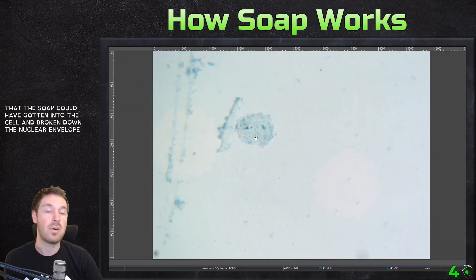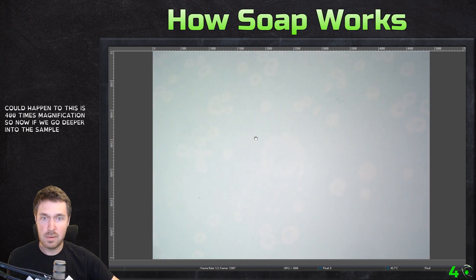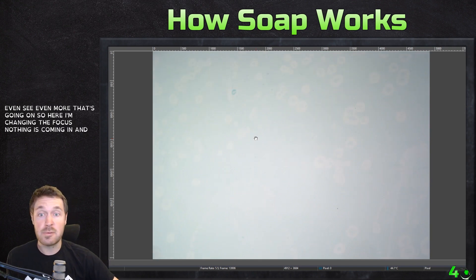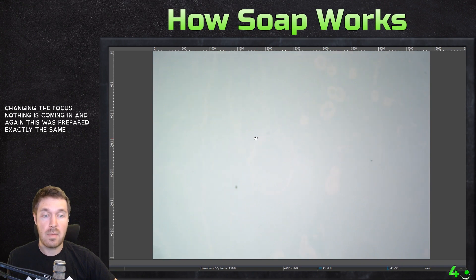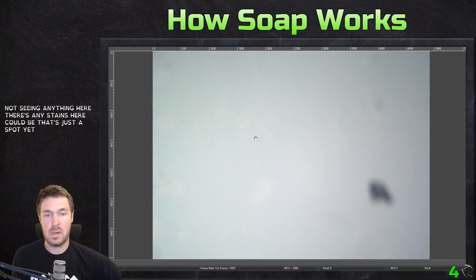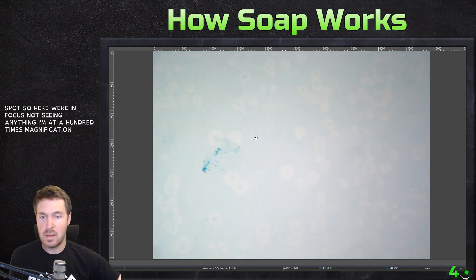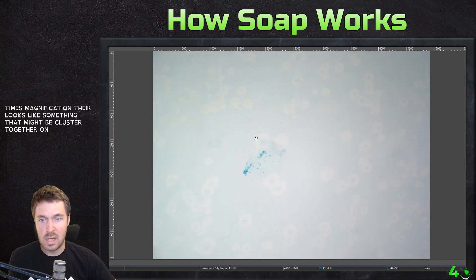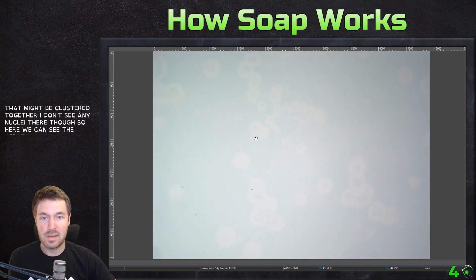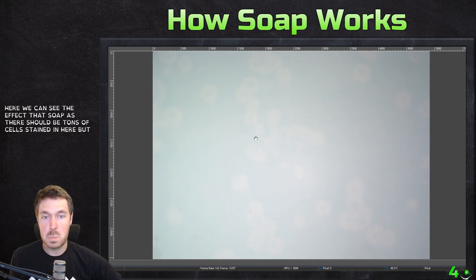So it broke down the nuclear envelope before it actually broke down the cell, which could happen. This is 400 times magnification. Now if we go deeper into the sample, we could see even more of this going on. Here I'm changing the focus — nothing is coming in. And again, this was prepared exactly the same. I am not seeing anything here. So here we're in focus — not seeing anything. I'm at 100 times magnification. There looks like something that might be clustered together, but I don't see any nuclei there. So here we can see the effect that soap has. There should be tons of cells stained in here, but nothing. There's a little blue spot there — we might see some stain, but that's from us releasing all the DNA.